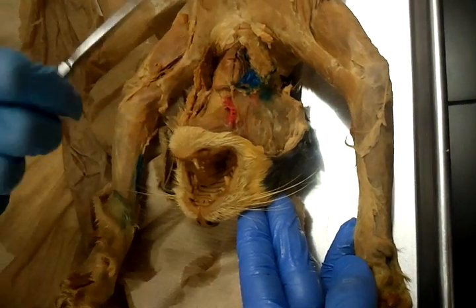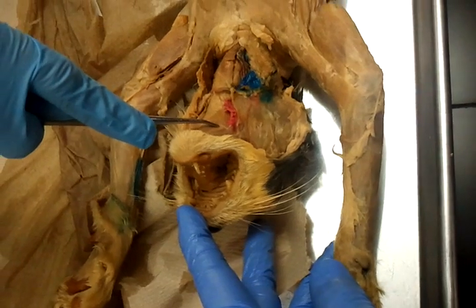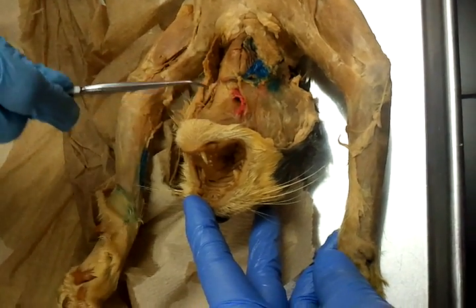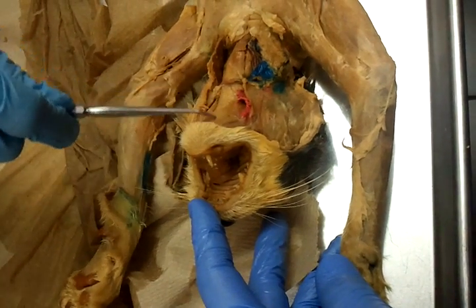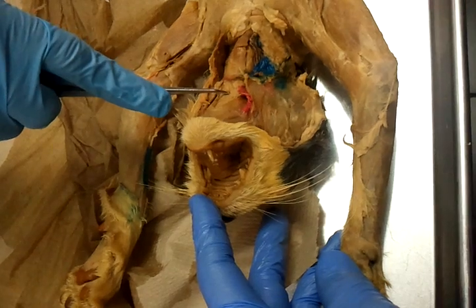Then you have this one — this muscle looks like a V. This is your digastric. Between the bellies of the digastric, you'll find this other muscle. This one should be your mylohyoid.